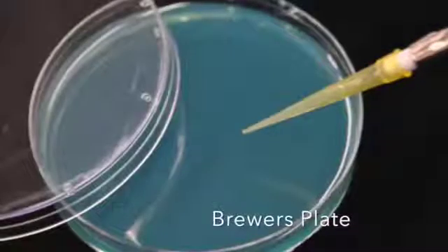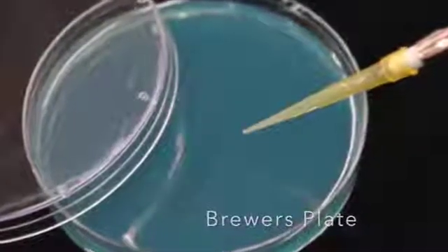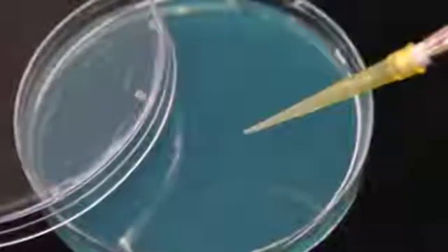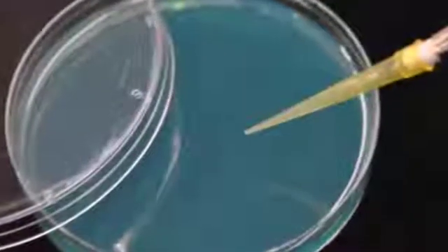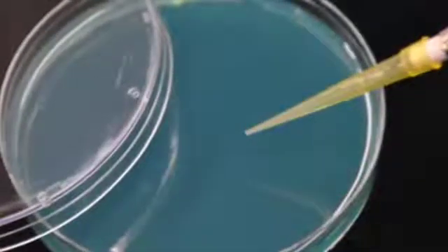A Brewer's plate will sometimes be used during this procedure because it contains thioglycolate, which will protect anaerobes and microaerophiles from oxidizing prior to being placed in the anaerobic jar.